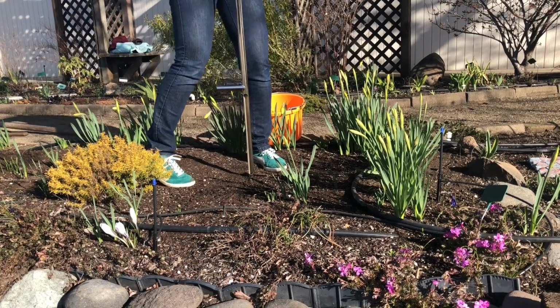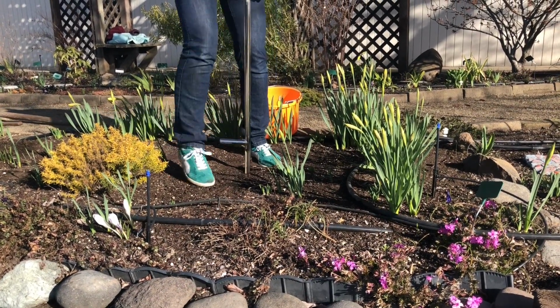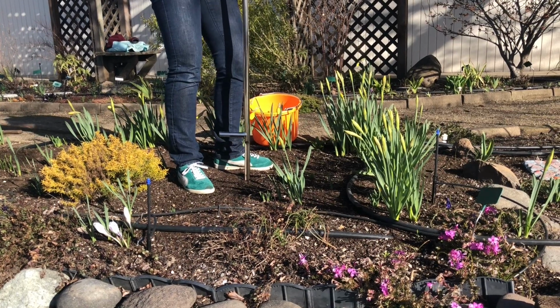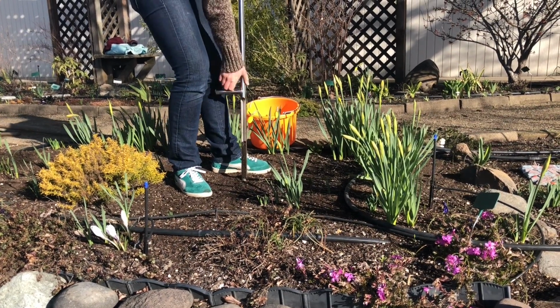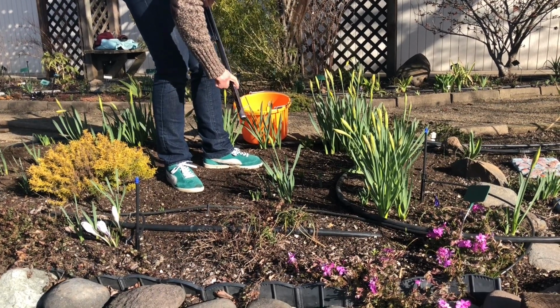Be sure to hold your corer perpendicular to the soil surface, and deposit your sample into a bucket or other receptacle.